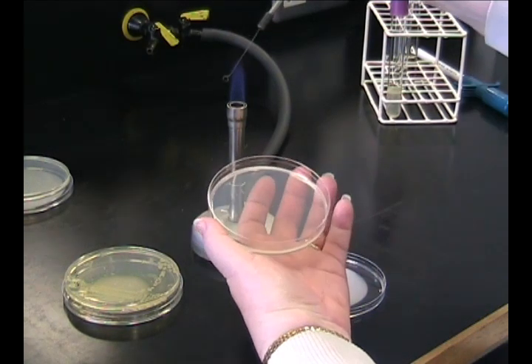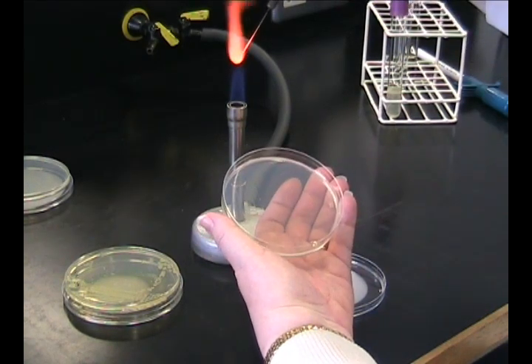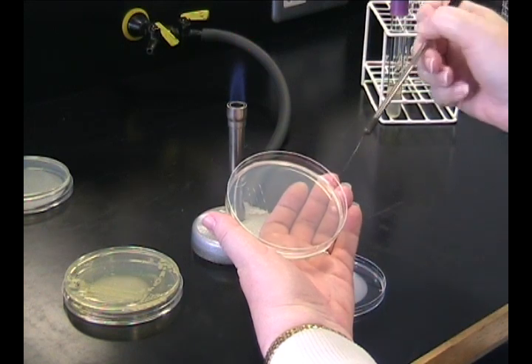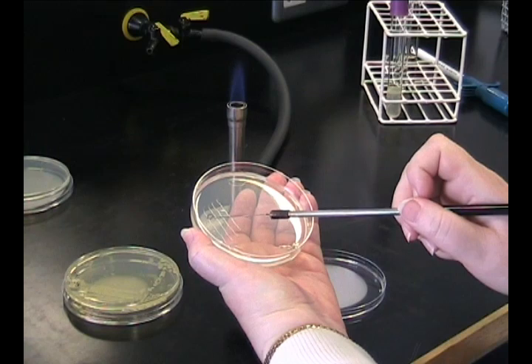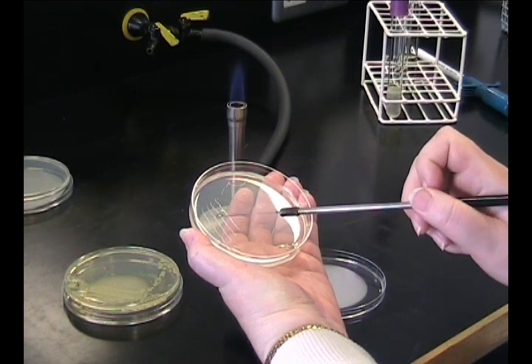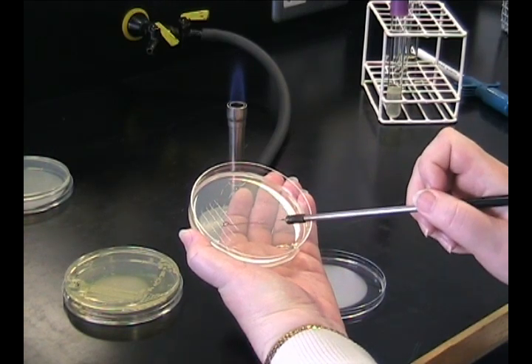It's important now to flame your loop again as before. Cool your loop and repeat this process, taking one streak from each of the four across your agar plate.